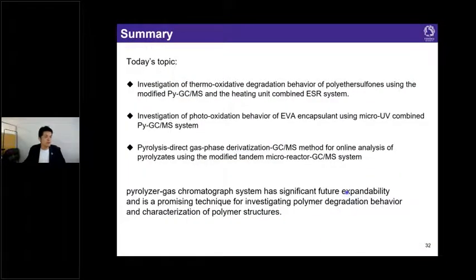Okay, so let me conclude today's talk. In this webinar, I introduced investigation of thermo-oxidative degradation behavior of polyethersulfone as a super engineering plastic using a modified PYGCMS system and the heating unit combined ESR system, investigation of photo-oxidation behavior of EVA encapsulant using micro UV combined PYGCMS system, and pyrolysis direct gas phase derivatization-GC method for online analysis of pyrolysates using modified tandem microreactor GCMS system. I'm sure that the pyrolyzer gas chromatograph system has significant future expandability and is a promising technique for investigating polymer degradation behavior and also characterization of polymer structure.